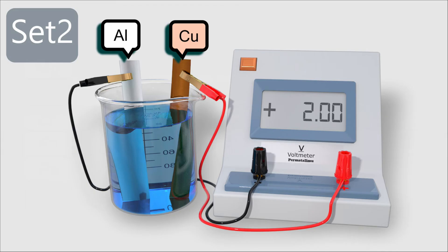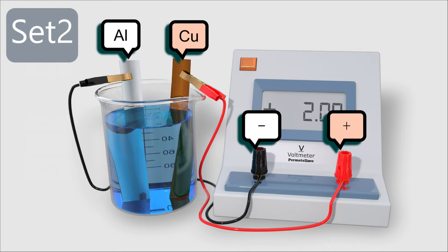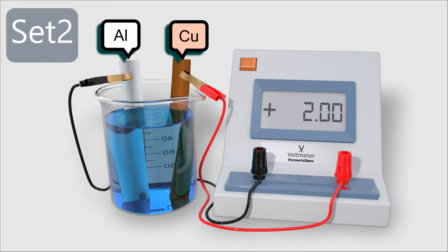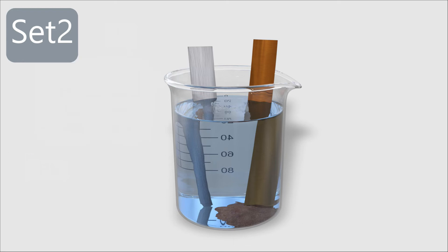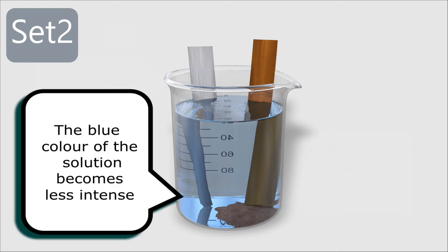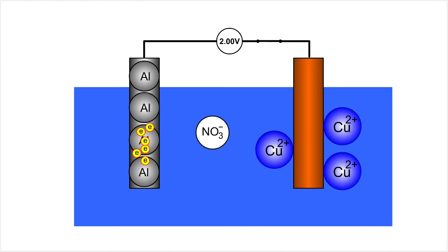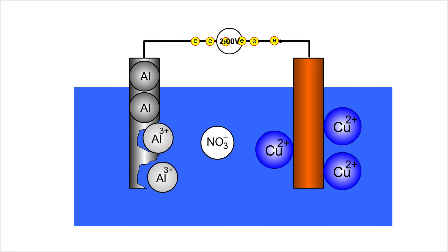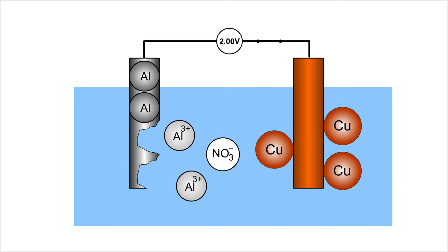For the second set, aluminium and copper sheets are immersed into the copper(II) nitrate solution. Aluminium is connected to the voltmeter at the negative terminal and copper at the positive terminal. Once the circuit is complete, it shows a voltage reading of 2.0V. At the end of the experiment, the aluminium sheet had dissolved into the solution, a brown deposit formed on the copper sheet, and the blue colour of the solution became less intense. Each aluminium atom donates three electrons, which move to the copper electrode, where each copper ion takes two electrons to form copper atoms deposited on the electrode surface.